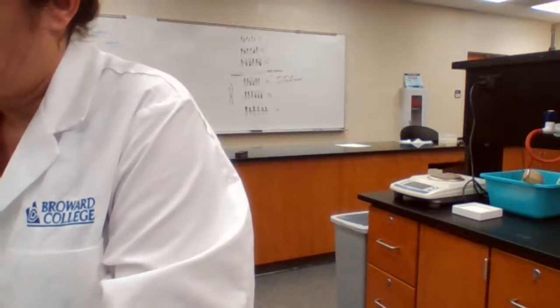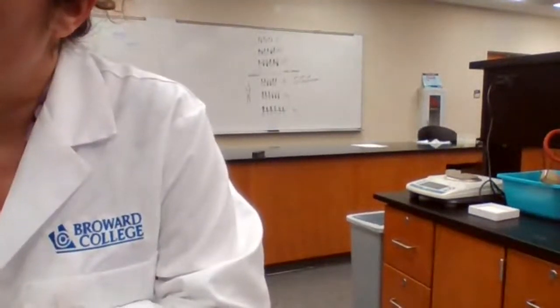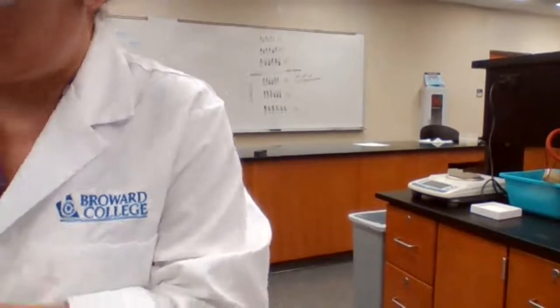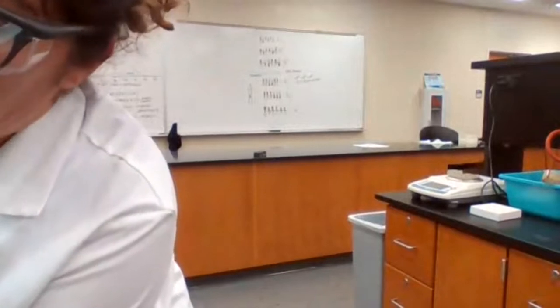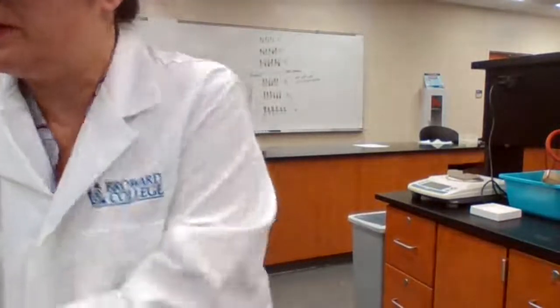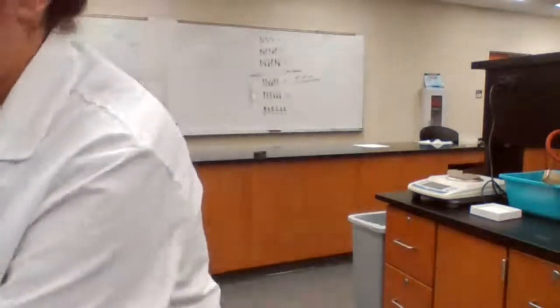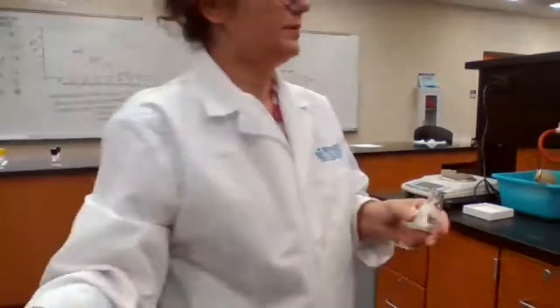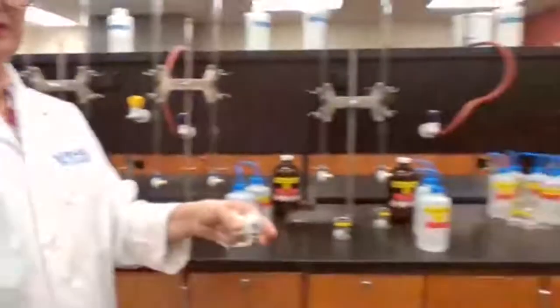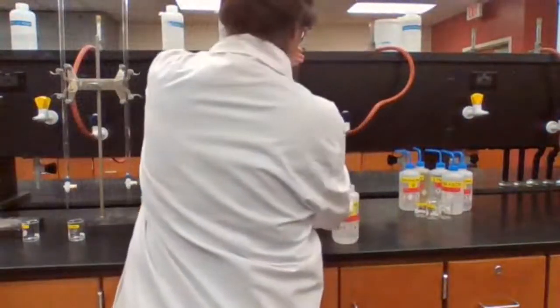Unknown B. Get unknown B. It looks like there's high concentration of the iron in the unknown A. I'm not 100% sure what the concentration is because I didn't look for the unknown, but whatever it is, we are following the procedure correctly and we're going to write what we see.